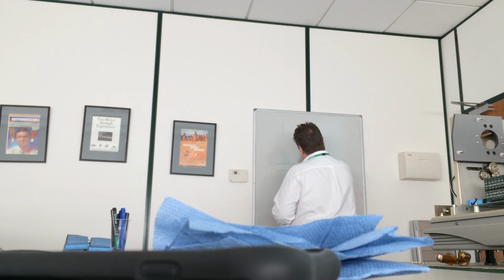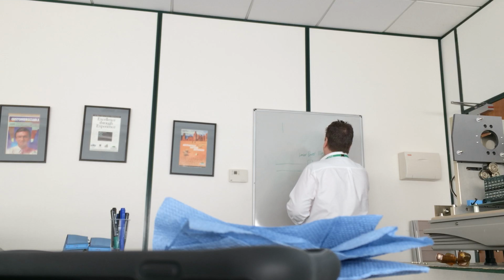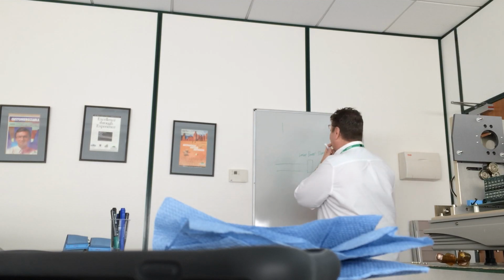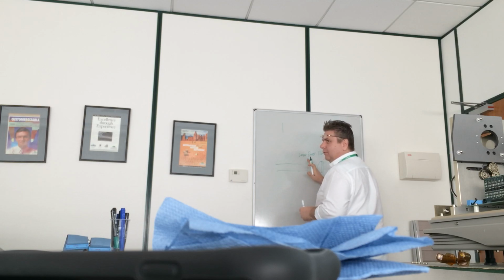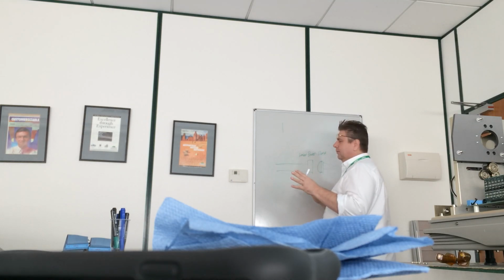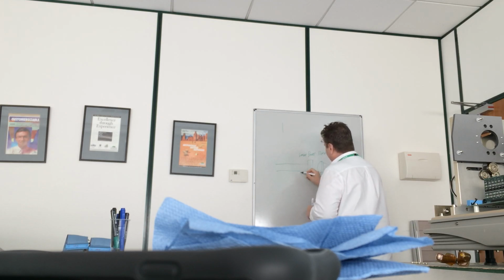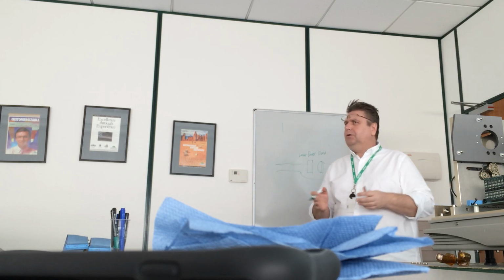So we'll say the laser power is 10 milliwatts. A nice round number. I mean, it's never 10 milliwatts. No, it's high. Okay, so let's just say it's 10. So everything's happy. We've got no sample in there, so it's a nice, ultra clean system. So the laser power here to the laser power there, we're measuring 100% of the laser power. Yeah? This is an ideal world.